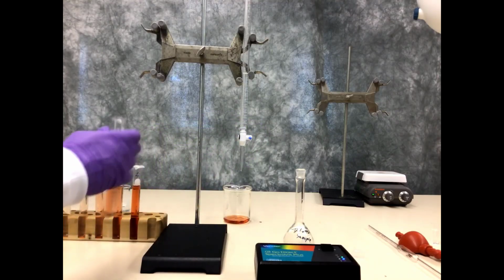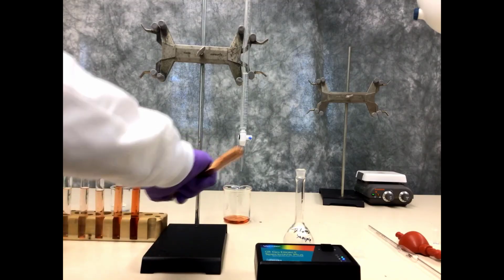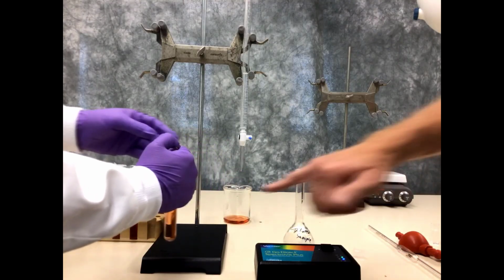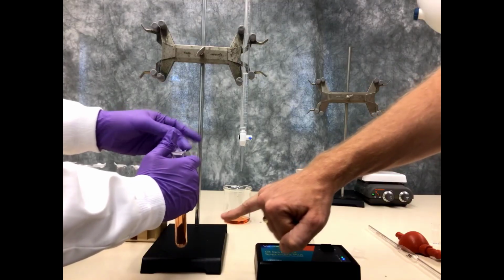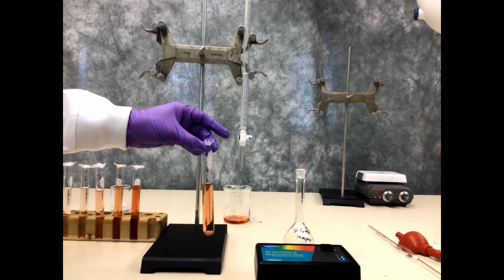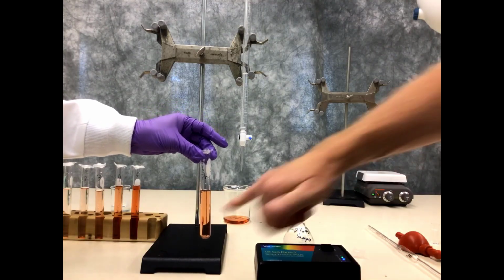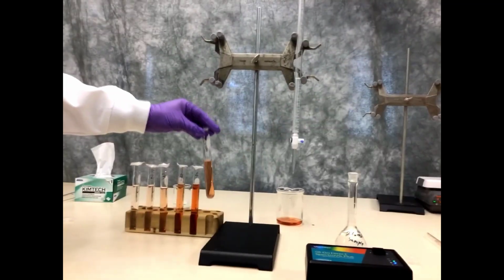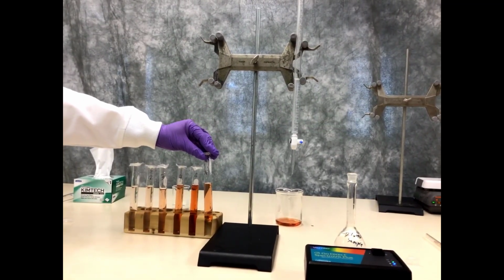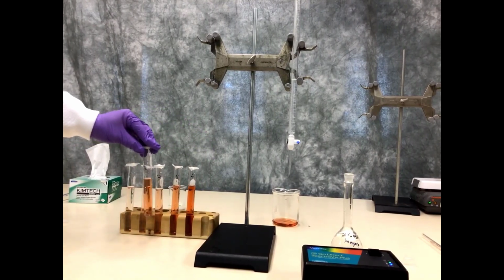We can see that our sample has turned the same pinkish red color as our standard, so we definitely got iron out of our cereal into our solution here. If we compare this to our standards visually, we can see it's not as dark as standard 5. It may look something around like standard number 4 in terms of its color intensity. We'll find out for sure when we do our Beer's Law analysis.